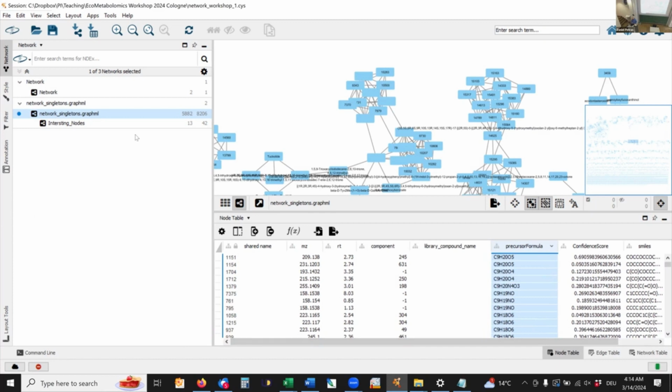Okay. So now we imported the molecular formulas, right? We imported the compound names and smiles code from CSI:FingerID. But there was another layer of information we got, which was the class level annotations from CANOPUS, right? So now I just need to import one more table, and then I think we're done for at least the information from SIRIUS.